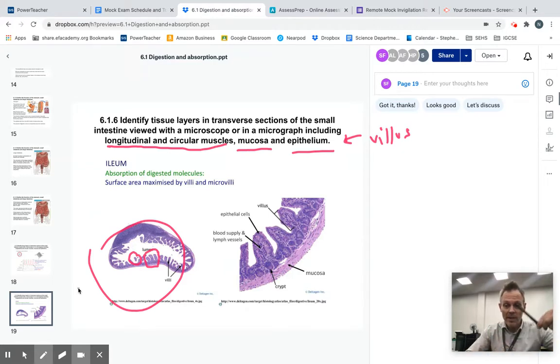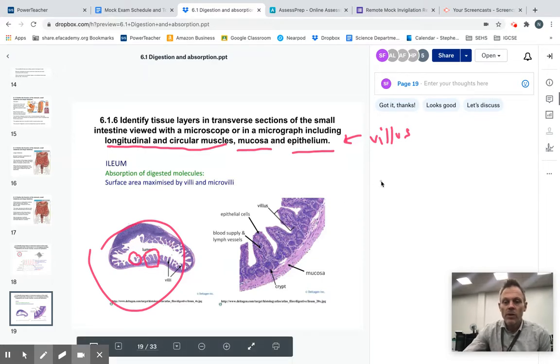If they're pointing in a certain direction and you cut that thin slice that will be in the microscope image, it might look like it's floating because the bottom part is not in the screen. So be careful when you see this, because sometimes it can be quite confusing. I'm just going to move this up out of the way.